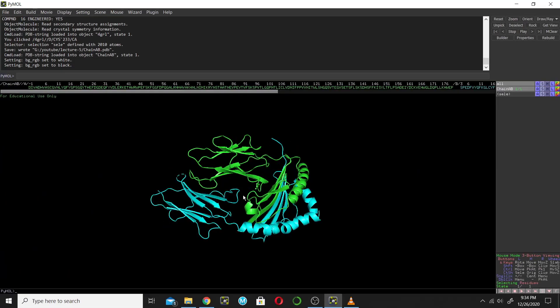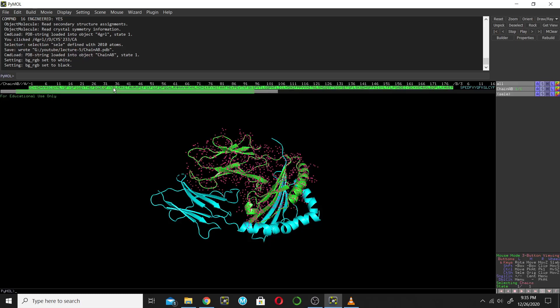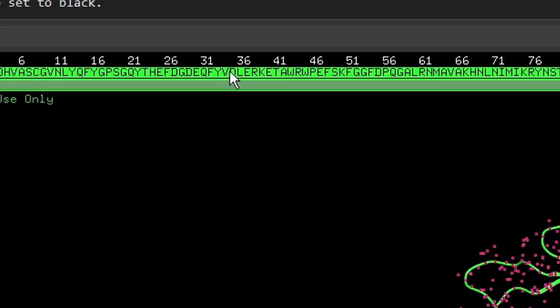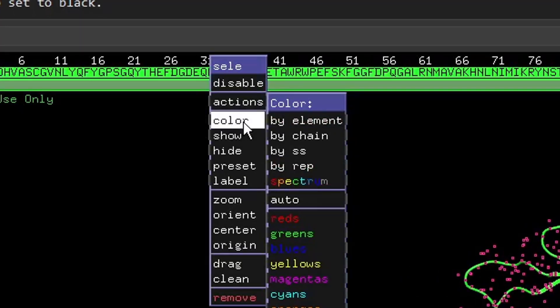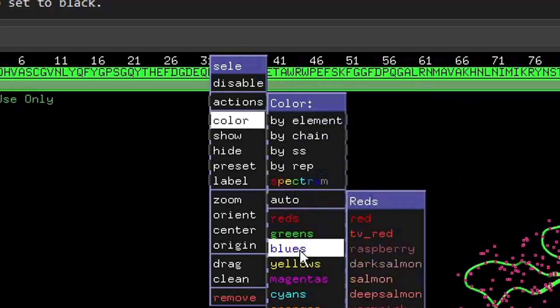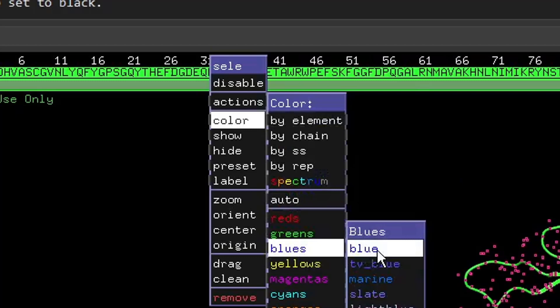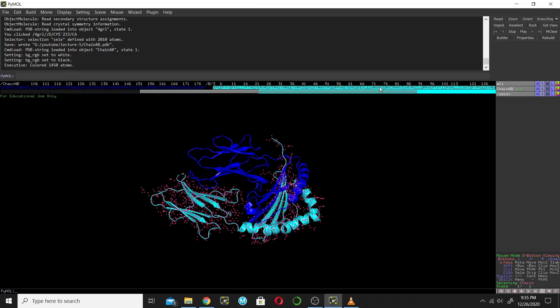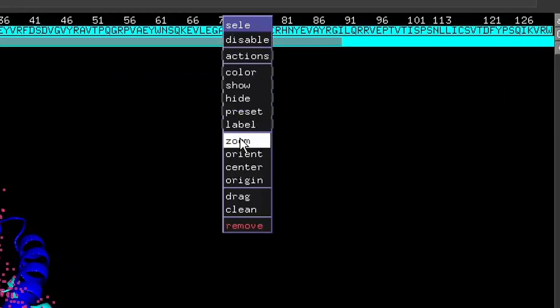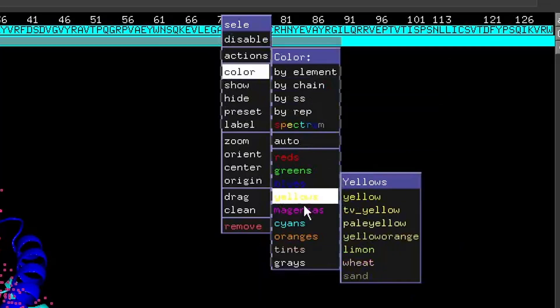If you want to give different colors to each chain, select chain A, then right-click, go to Color, and choose a color — for example, blue. Chain A is now blue. Then select the other chain, right-click, go to Color, and choose yellow. Chain B is now yellow.